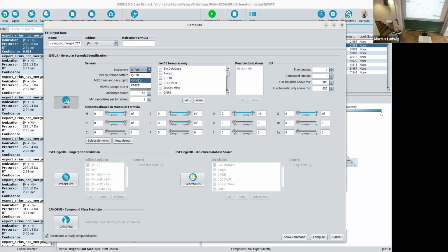It's just if you know you have really some better mass deviation, you can go for this parameter. It usually just makes it a little bit faster, but not so many changes in here. So this is usually not so important. If you know you have really good mass deviations, low mass errors, then you can use it with FTICR, but it also doesn't break the method. If you just do this, you will just get more molecular formula candidates with higher mass deviations in there.